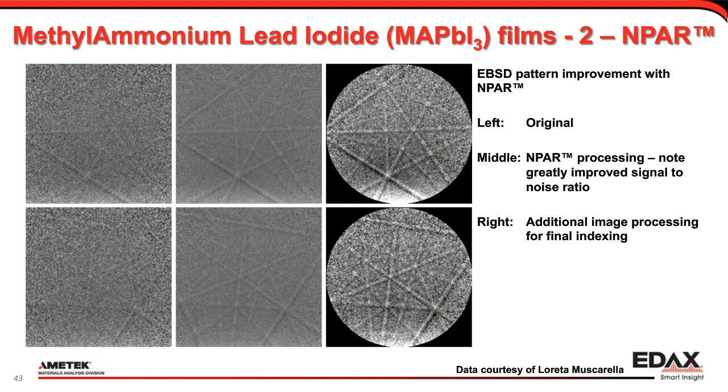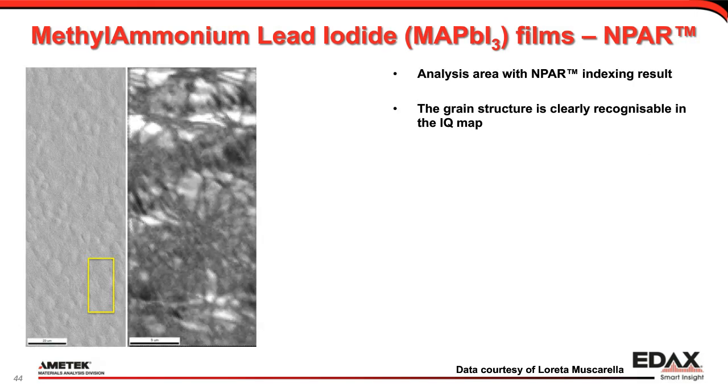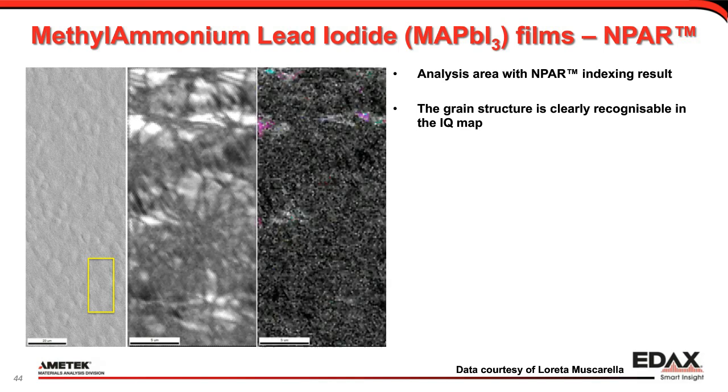Now, there's the indexing result. And if I index that, then this is the image quality map I get from the same area. And just to remind you, this was the original one. So we can just make out where they match. In the middle, there's a few slightly brighter spots in the IQ map. Those were the really white areas in the new IQ map towards the top.